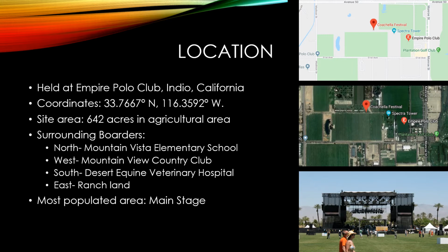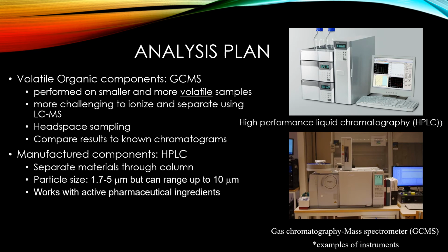So, like I was talking about earlier, the most popular area that we took the soil samples from was the main stage, because that was where the most people were. So my analysis plan was to perform two different analyses. We broke it down to both the volatile organic components and the manufactured components.